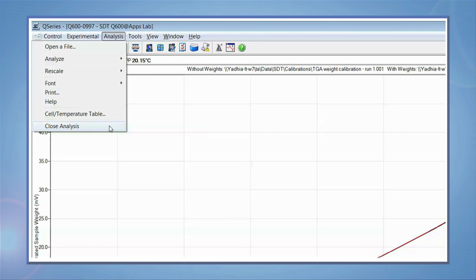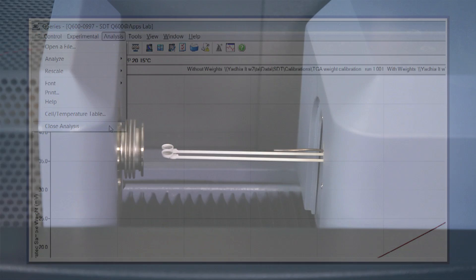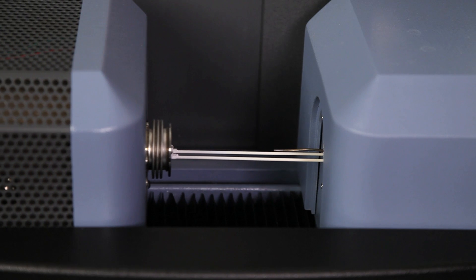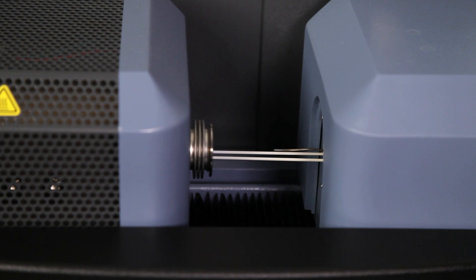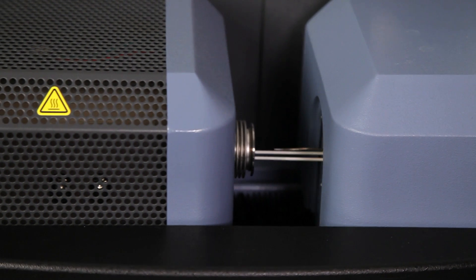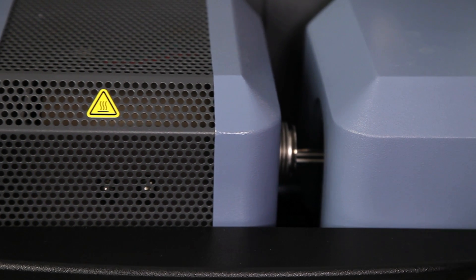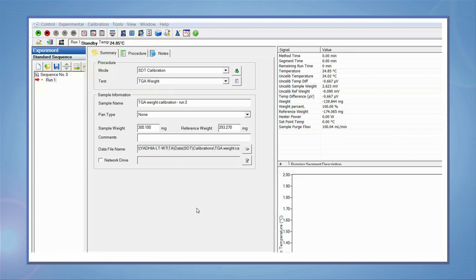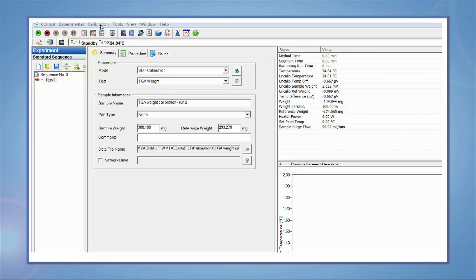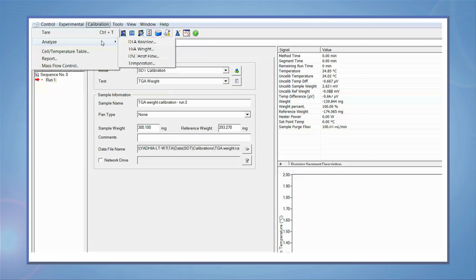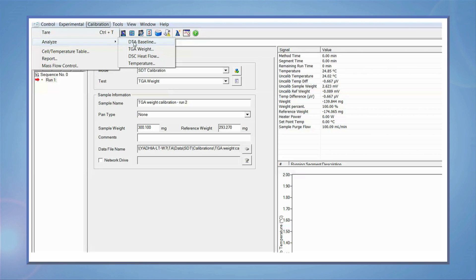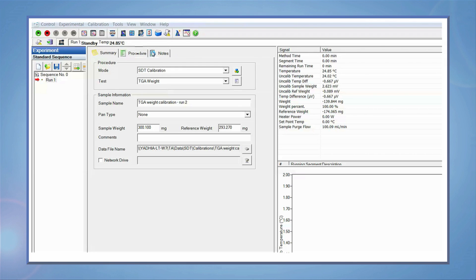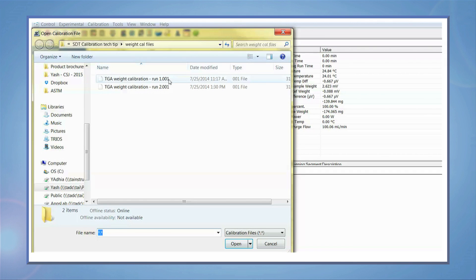The empty beam run can also be used for the DTA baseline calibration. Select calibrate, analyze, DTA baseline. Select the file corresponding to the empty beam runs.